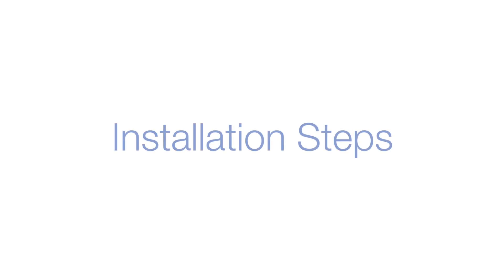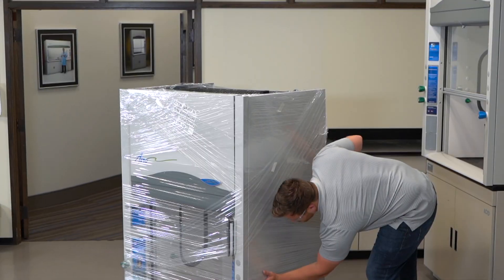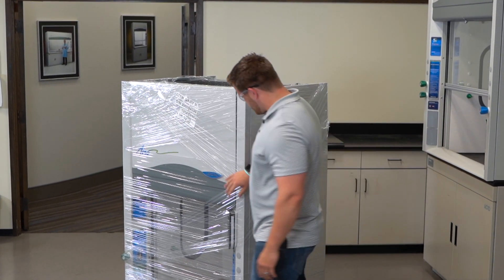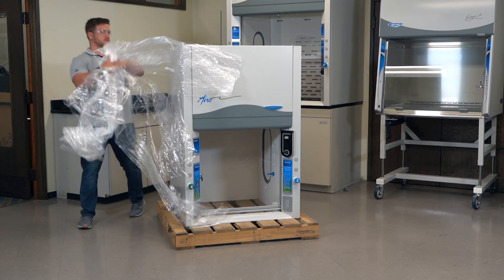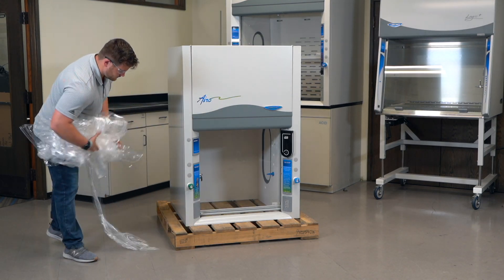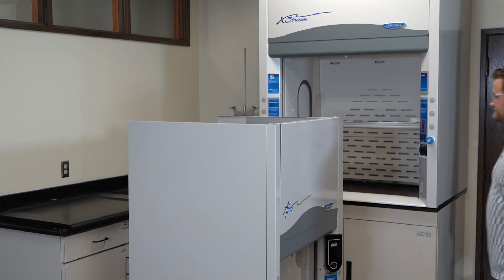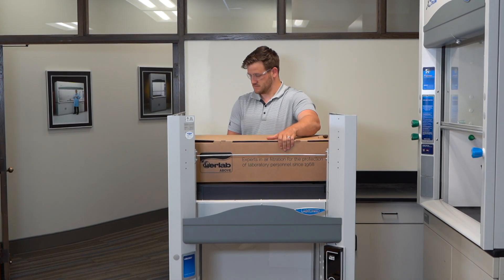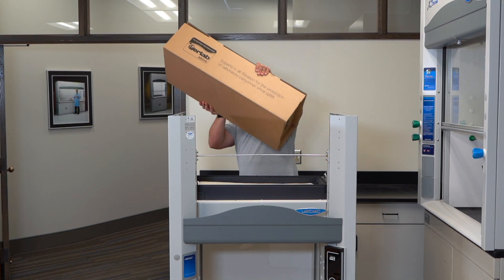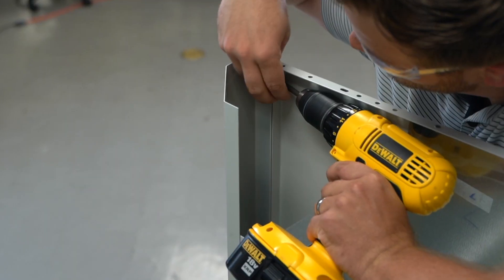To install your new Protector Echo or Protector Aero, follow these steps. First, inspect and unpack the filtered fume hood — remove the shrink wrap and box and inspect for any damage that may have occurred in transit. Then remove the header panel on the front of the hood, and remove the fan box or boxes from the top of the hood. Remove the side panels and sash restraints.